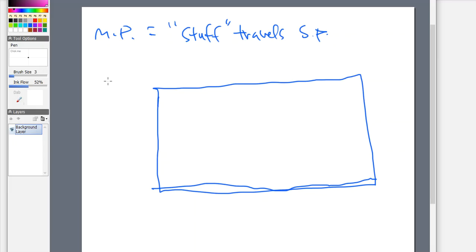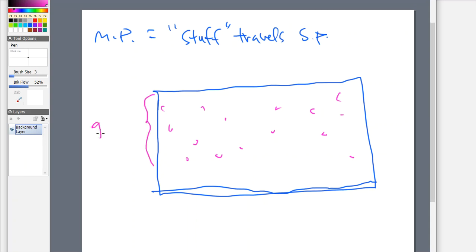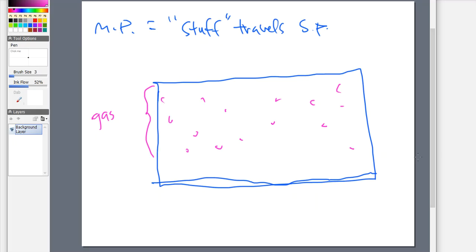And the first thing that I'm going to allow to happen is, bloop, bloop, bloop. It's going to create gas phase. And this gas phase has got to come from somewhere. And that gas phase are volatile components that are coming from your developing solvent. That's what this is. So for instance, let's say that I make a 50-50 mix of methanol and water. I pour it into the tank. That is my developing solvent. I put the lid on it and I wait for 20 minutes.